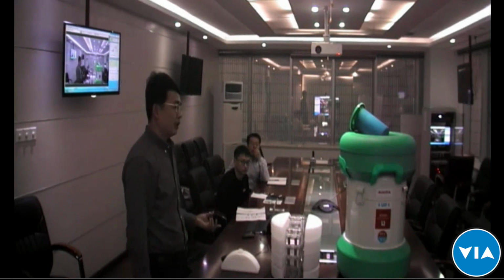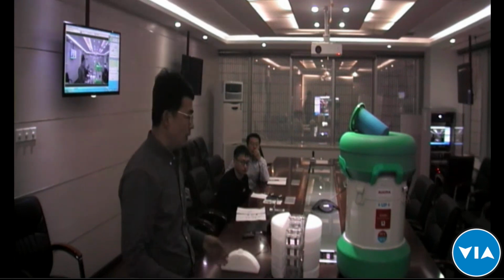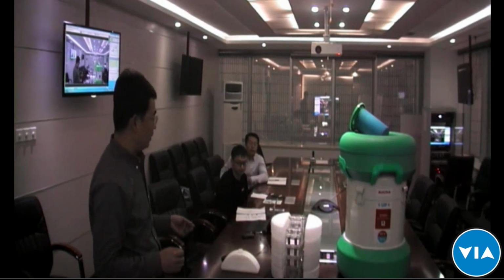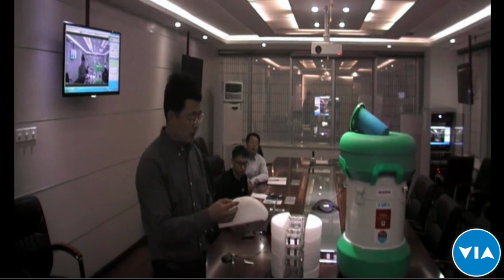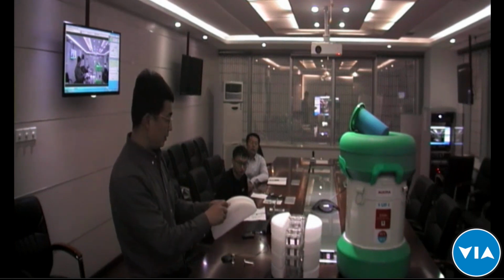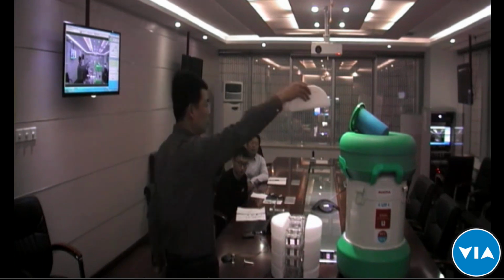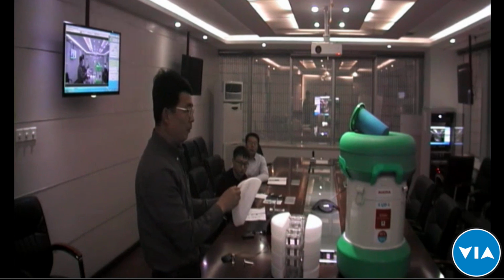After the introduction of the components, I want to introduce the ice blocks and the vaccine decks to you all, because these two components are very important to the function of this device. First is about the ice blocks. Here I want to introduce how to use the ice blocks, how to fill water into the ice blocks, how to freeze the ice blocks, how to condition these ice blocks, and after all these steps are finished, how to place the ice blocks into the device.